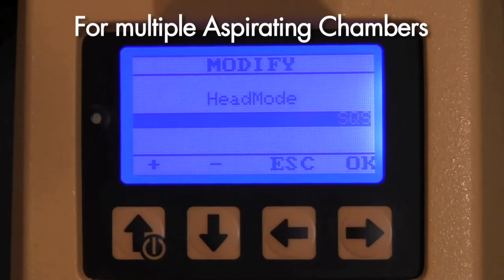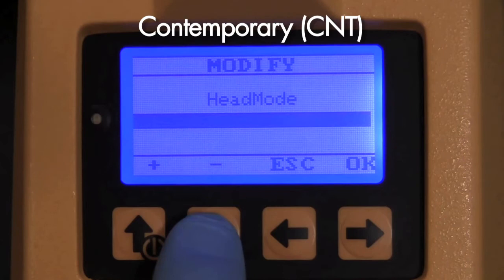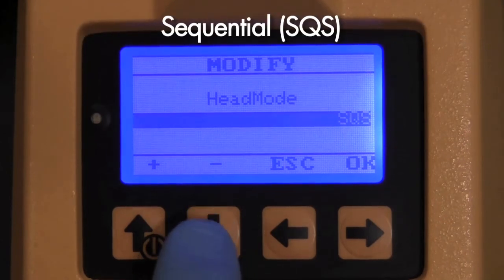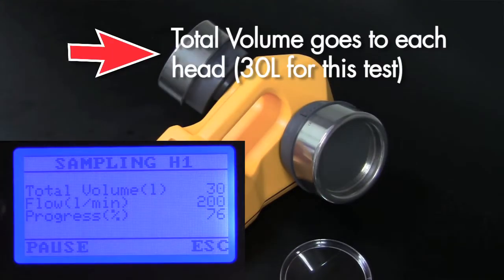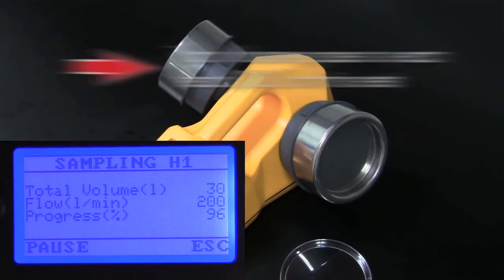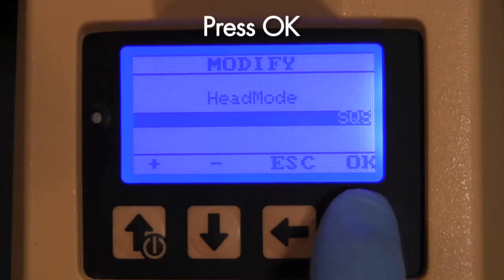For instruments with multiple aspirating chambers, you may set the head mode. Indicate contemporary or sequential activation of the sampling heads. For multiple heads, the heads begin impacting at slightly different times regardless of which mode you have chosen. This is to save the life of the internal motor and does not affect the sample. Press OK.